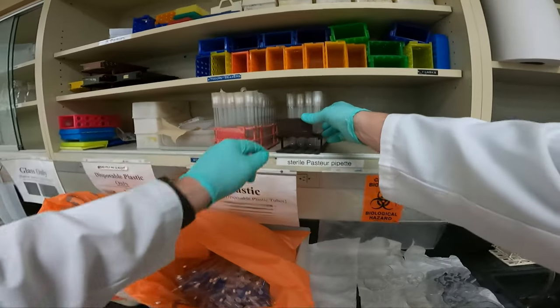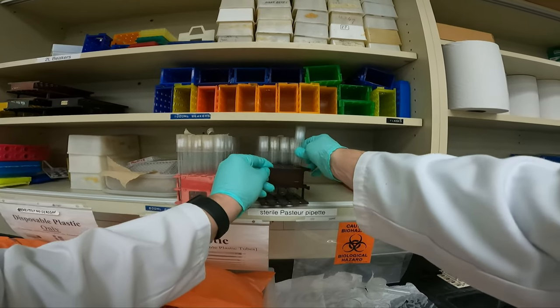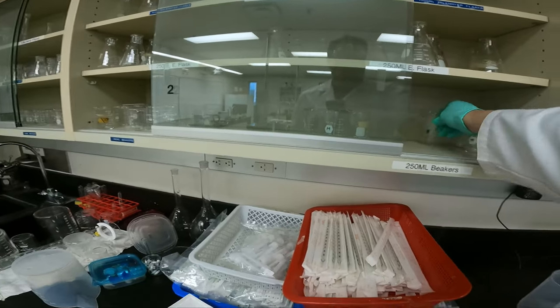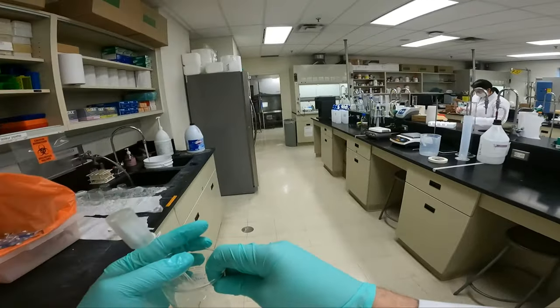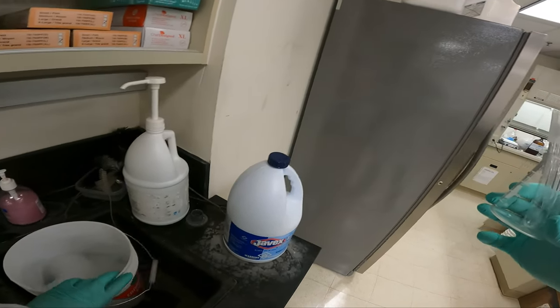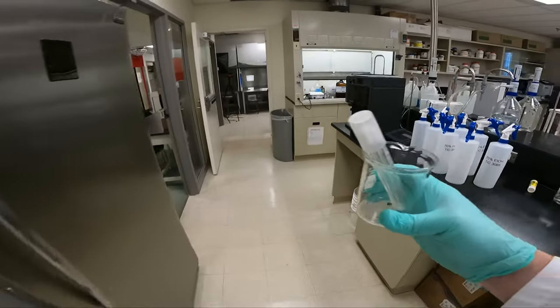From outside the lab, we'll need a tube of sterile Pasteur pipettes, and we'll need a 250 ml beaker. We'll go back to our laminar flow hood room now.